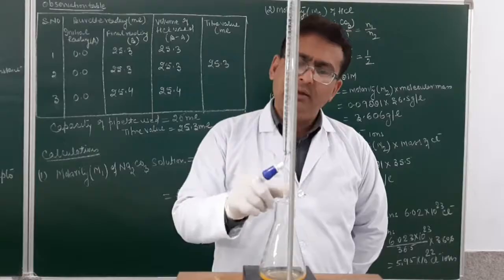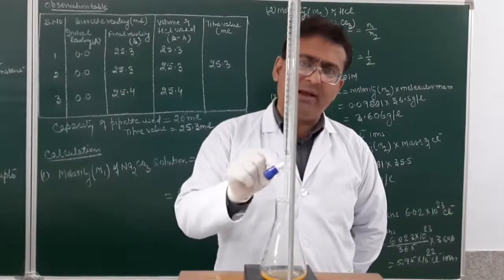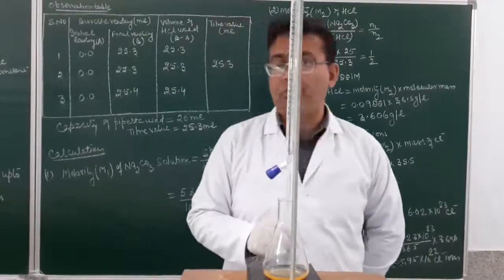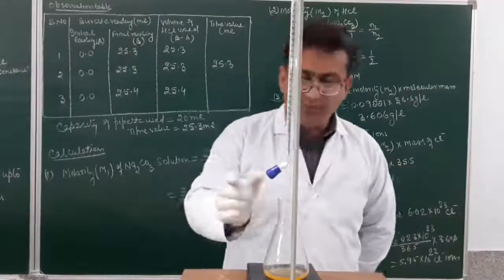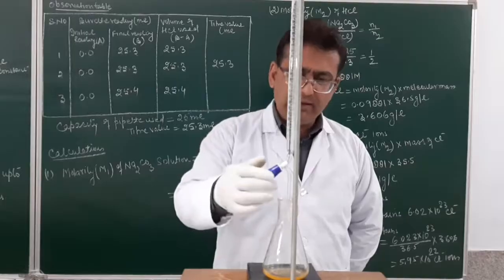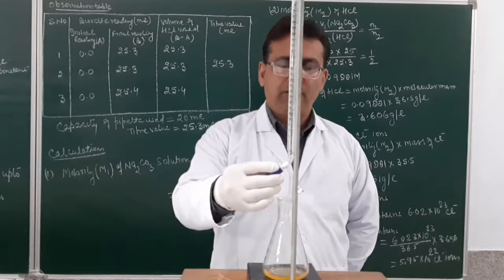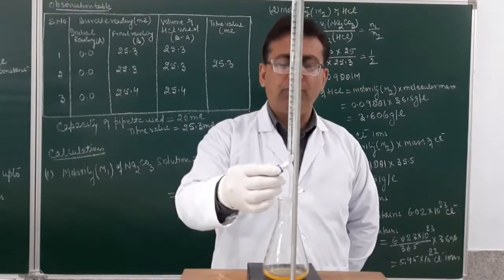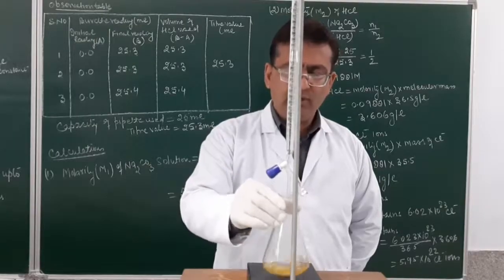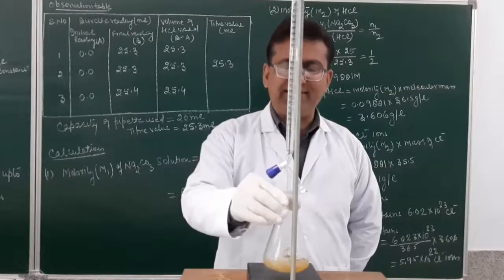As soon as the neutralization occurs, even a single drop of addition of HCl will make it acidic in color. And with acid, the methyl orange solution will become pink in color. So we'll observe when the slightest pink color appears. In this case, we will add in a dropwise manner the solution of HCl into the sodium carbonate solution, in which methyl orange is added, and this is being done with constant stirring.